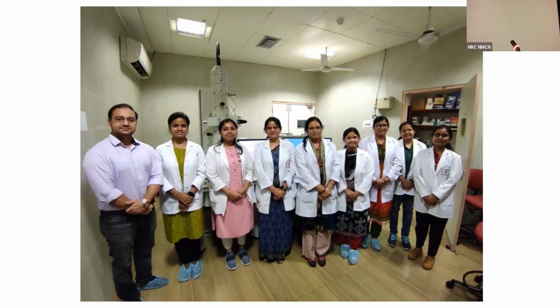But ideally, if you have a lab which is working nearby, it is better to process it, osmicate it, and then keep it in buffer. So that is what we do. So if, for example, we have a tissue which is very large, we know that we will not be able to make so many blocks. So we take the tissue of interest and the rest of the tissue we keep in fixative, but we can also process it in buffer. And because it is already osmicated, it does not matter. It is fixed, osmicated.